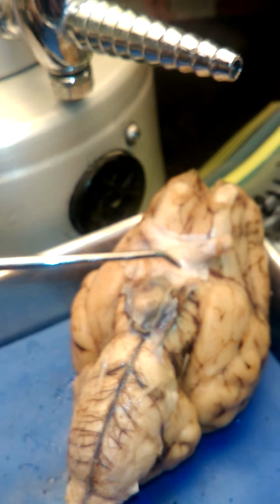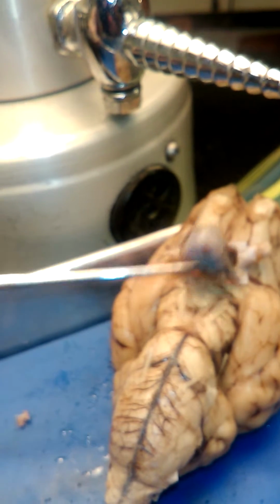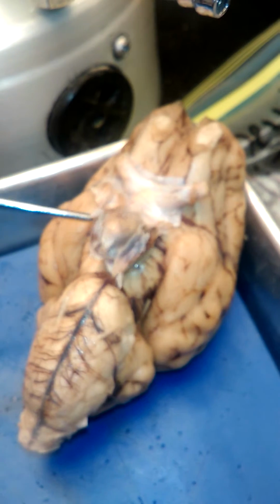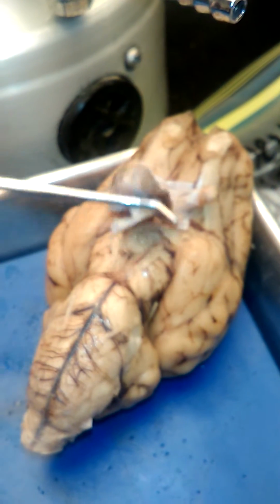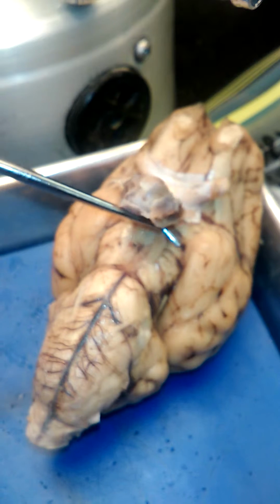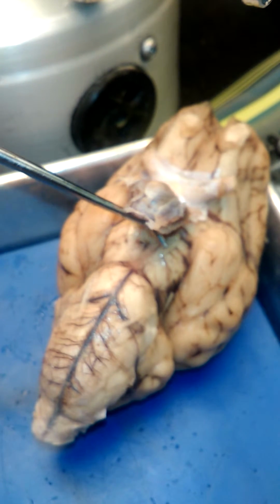And the next nerve, we're going to pull this up, and what I'm pulling up is the pituitary gland, okay? So we're going to lift up the pituitary gland, and underneath it, we're going to lift that up. And right here, you see that right there that I'm pointing to?